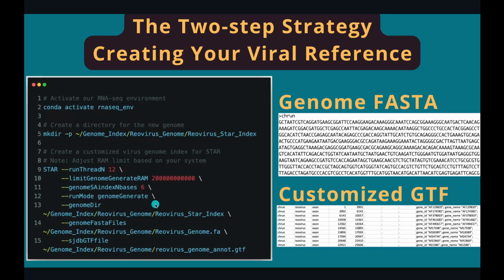And then we specify the input files, the FASTA file for the genome and the GTF file. And here we want to make the index, so specify the output. You don't have to create a host reference, because in my previous videos, you can directly download the pre-built index for STAR, for human or mouse or for many other model systems.